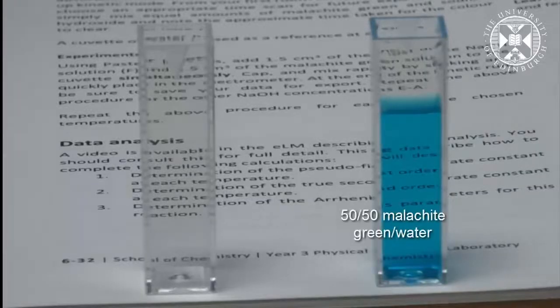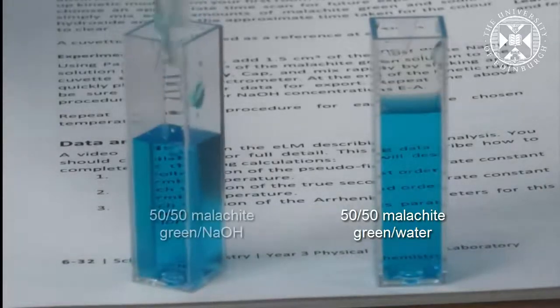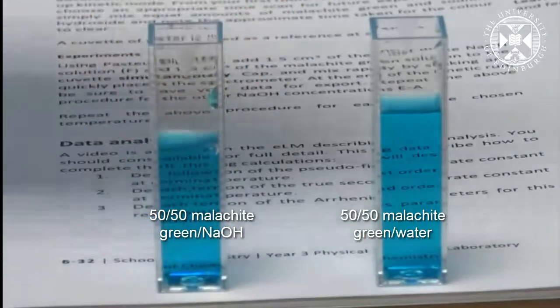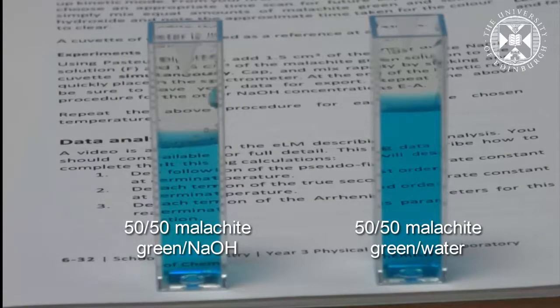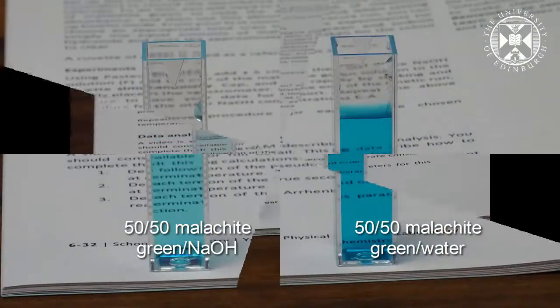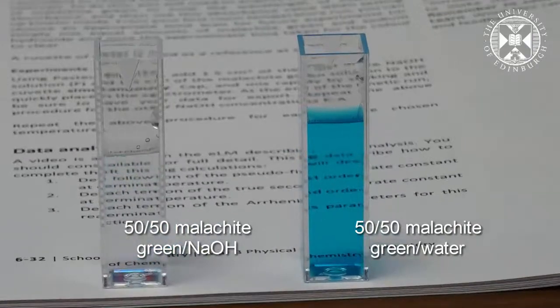We can watch this happen in real time to get an idea of what the spectrometer is measuring. On the right hand side there is a solution of malachite green diluted to half with water. On the left hand side equal volumes of malachite green and sodium hydroxide solution are mixed. After mixing, the camera is recording the change in color of the mixture. This is sped up here for convenience; the actual time was over the course of several minutes.